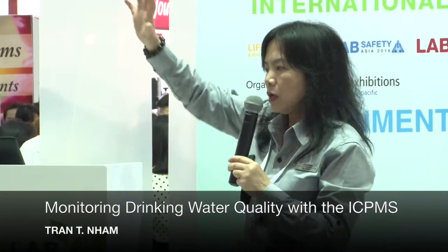Okay, so what is the ICP-MS instrument, right? You can see over there, there's an instrument that's called ICP-MS, right? May I ask, for those of you sitting here, does anyone have experience with operating ICP-MS?